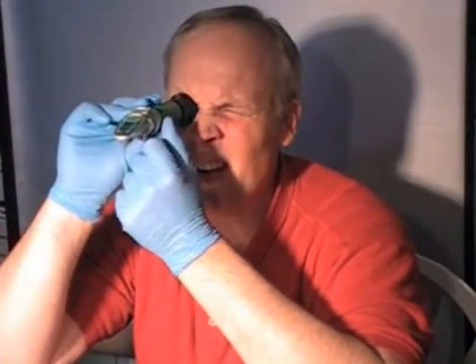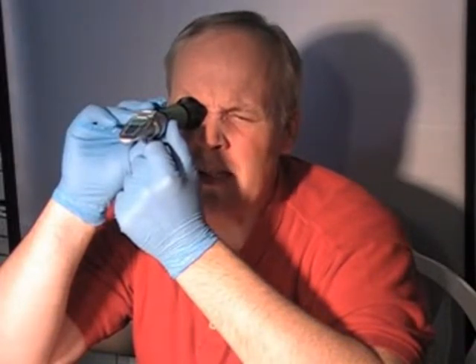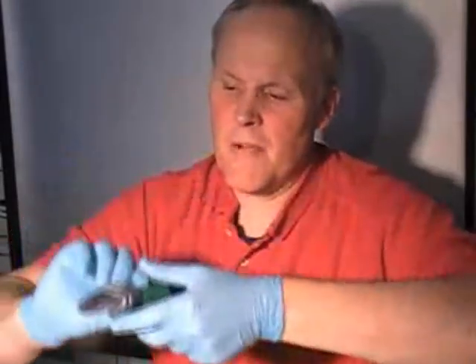So I'm looking at this one. You want to look at the shadow. When you look in, you'll see large lines and shorter lines in the middle — the large lines are each a full point and the shorter lines in the middle represent 0.2 points. This is graduated into full numbers going by point two. I'm looking at this one and it's three large lines up and then one short line up, so that's a 3.2. It's actually in between the first and second small line, so that is a 3.3 sugar. We have a 3.3 sugar — we'll remember that.